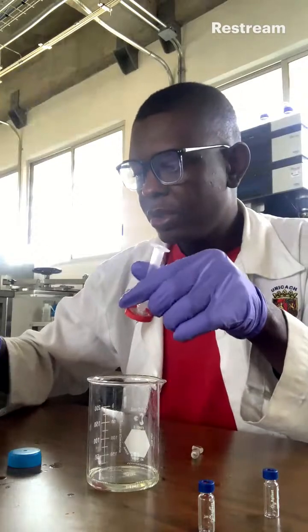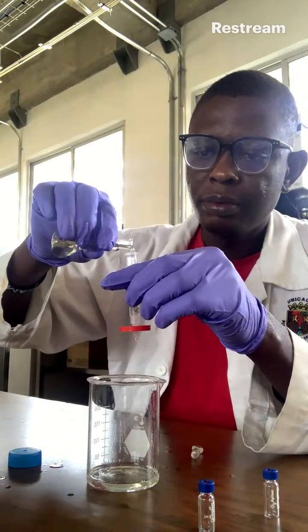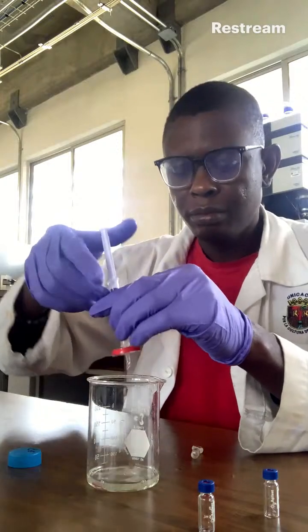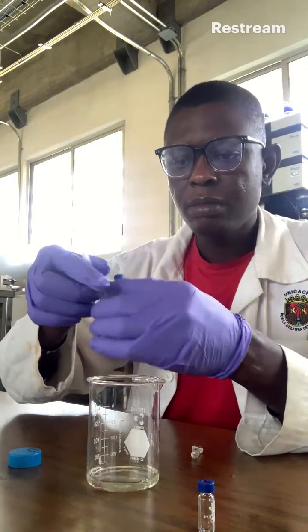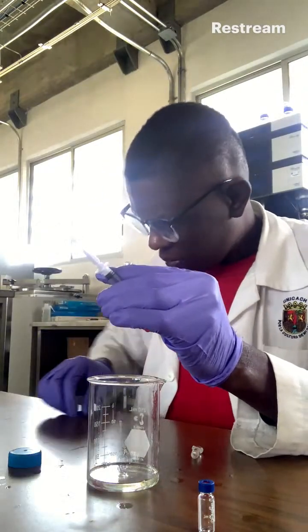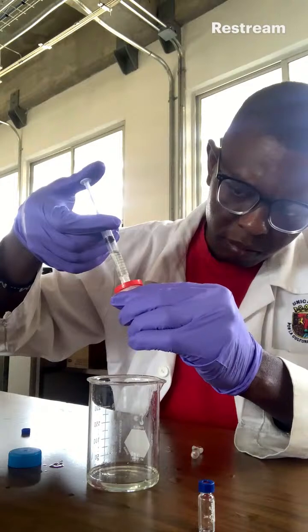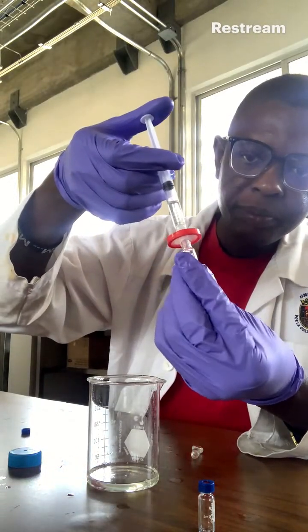So I have washed the syringe. I'm filling it up.